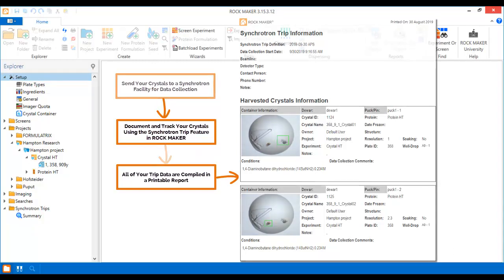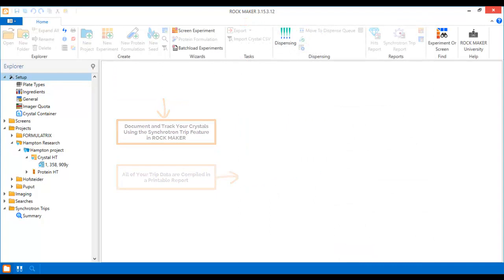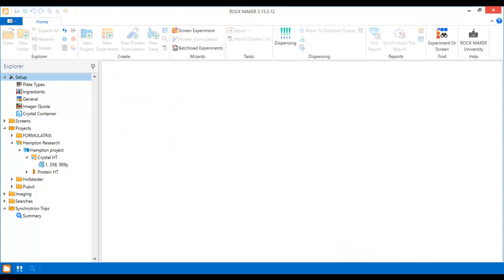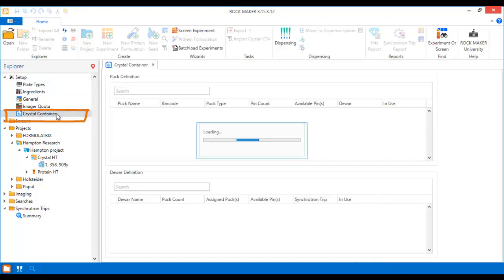Let's take a quick look at how to manage our synchrotron trips in RockMaker. Before you can send your crystals on a synchrotron trip, first you need to define your pucks and doers in RockMaker, which you can do in the Crystal Container node on the Explorer.